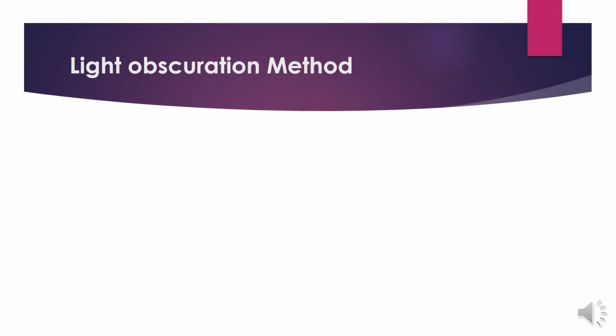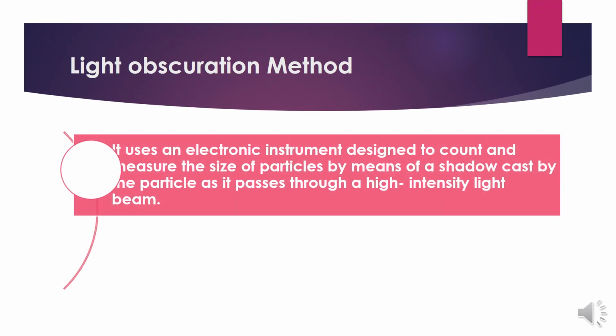As discussed earlier, these remaining methods use some sort of instrument or equipment to check the particulate matter in parenteral preparations.